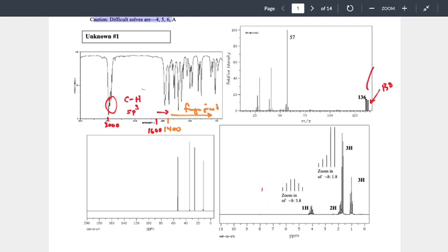Remember how I said I drew those on there? If we delete those, what you see is something that you see like right there. Do you see those 2 peaks there? How far away are those 2 peaks?